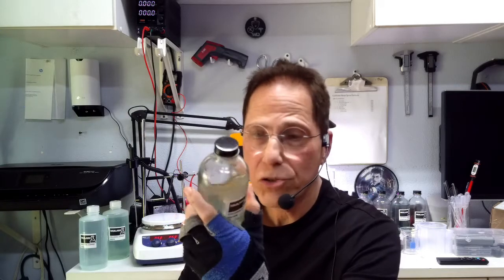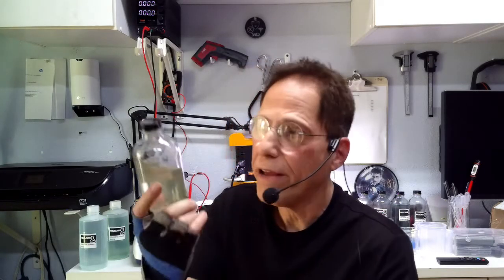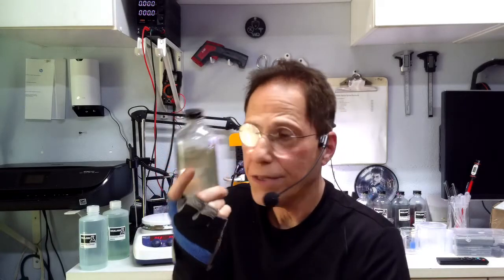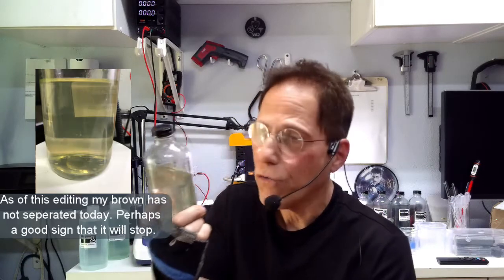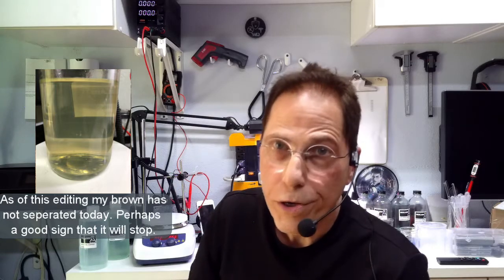The problem with the brown is the same problem I had with cooking this cyan and the green using citric acid or vinegar. It doesn't stay in the solution. This one's worse. Copper brown is worse. Every day I got brown stuff falling out onto the bottom of this, and every day I filter it, and I want to see how far this is going to get over time to see if I got a clear liquid with no colloidals left in it.